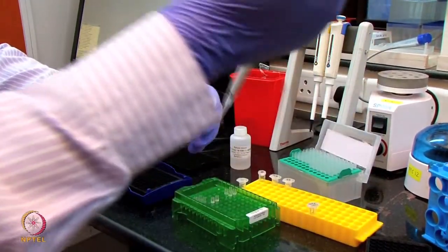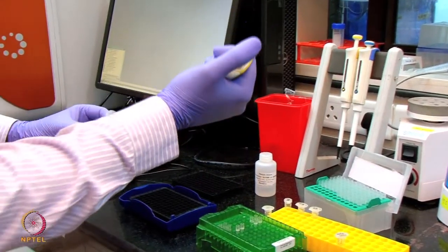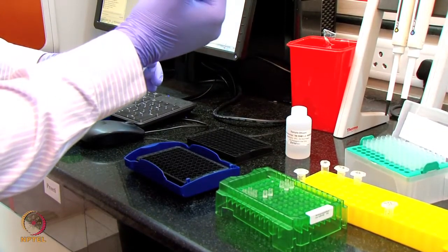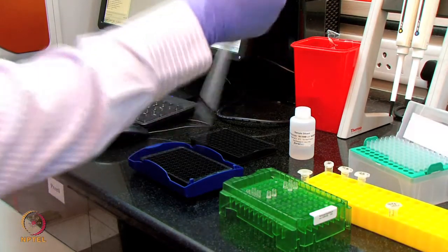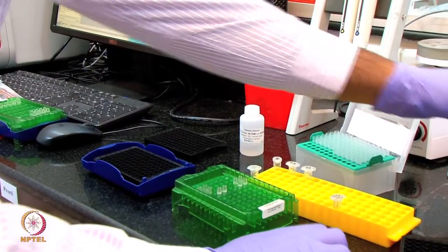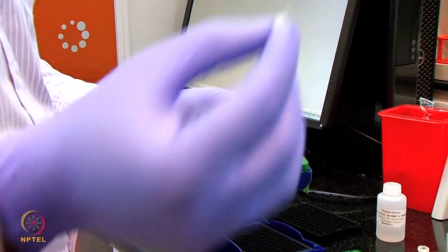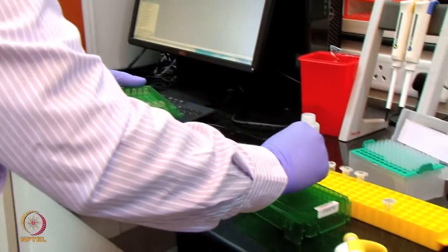What I am doing is I am adding 200 microliter of the 1x PBS into the 96 well plate. Now, next step, I am taking the biosensors, which are the streptavidin sensors. These are the sensors, they look like this. I am going to put them onto the sensor tray.